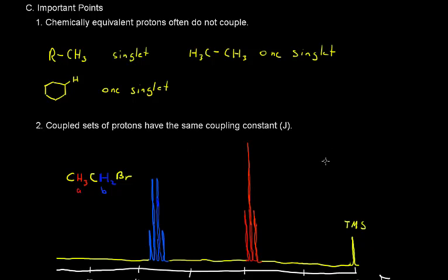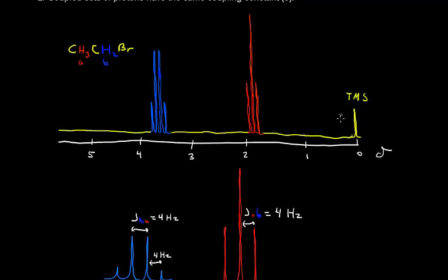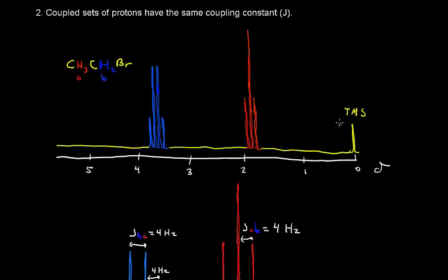Another very important concept: coupled sets of protons have the same coupling constant.